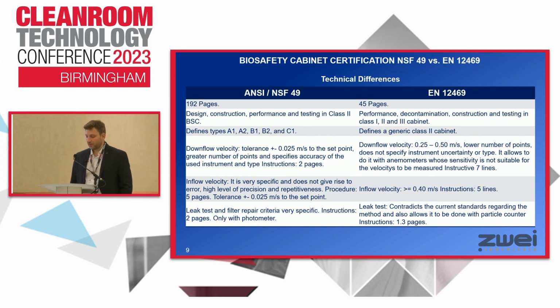Bear in mind the right method with a particle counter should take around 20 minutes per filter, and also most leaks cannot be detected. A small leak is very difficult to detect with a particle counter method.